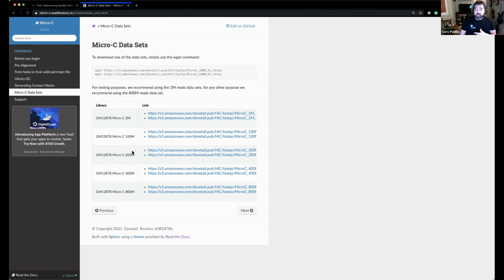And then if you're getting ready, or you expect you're getting between 800 million and a billion reads coming off the sequencer in the next week or so, and you want to know what timelines to be expecting with that amount of data, we have an 800 million read pair data set for you to download. They are large files, so be prepared, but you should grab them and start processing them so you have a feel of how to work with data that's that large.